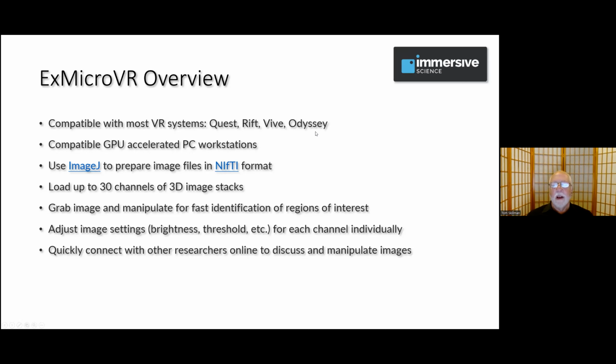There are many different VR software manufacturers. Quest is probably the most popular right now because it's the best system at the lowest cost. You do need a compatible workstation. It only works on PC. It doesn't work on Mac. This has to do with the background of how VR was developed, and somehow they decided to go on a Windows platform. So you need access to a Windows workstation and a GPU accelerator, one of these NVIDIA GPU cards.